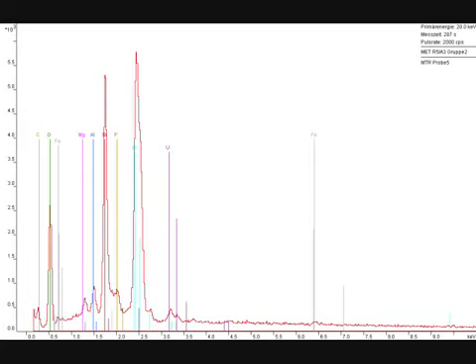You can see the different peaks there. Each element is labeled with a different color. So for bismuth, you've got those bright blue peaks here, and you can see there are multiple peaks all over, which could be accounted for by that element, but bismuth is quite clear here. Just to the left of that, the other big peak is from silicon. You can see that's quite a big peak as well. And we've got on the right, in dark purple color, uranium, and we also got aluminum, magnesium, oxygen, and some carbon.